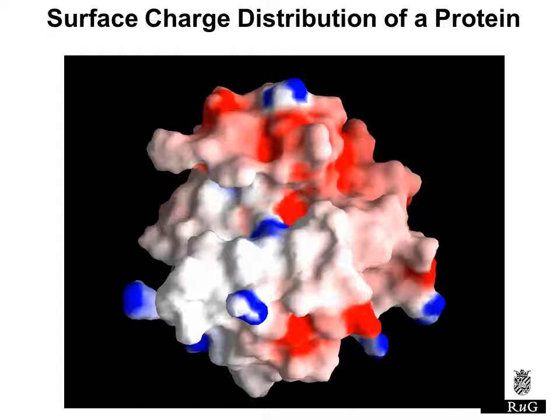In electrophoresis, you can now imagine if the red negatively charged amino acids exactly balance the number of blue positively charged amino acids, in an electric field there will be a force in the one direction to one electrode and an equal force in the electric field to the other electrode. As the force is by far not strong enough to rip the protein apart, the protein will simply stop moving because it's pulled from both ends with the same force.